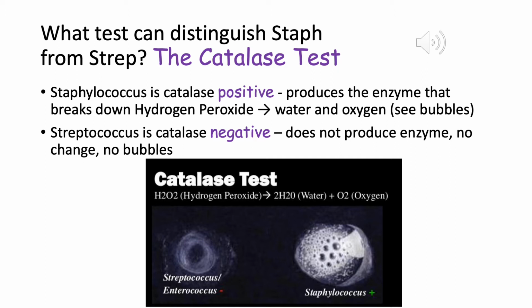I'm going to give you a way to remember this, and I'm going to give you a lot of tips for remembering the outcome of the different tests. For this one, you can think of a friendly staff of nurses in a hospital. So think of staff is bubbly.